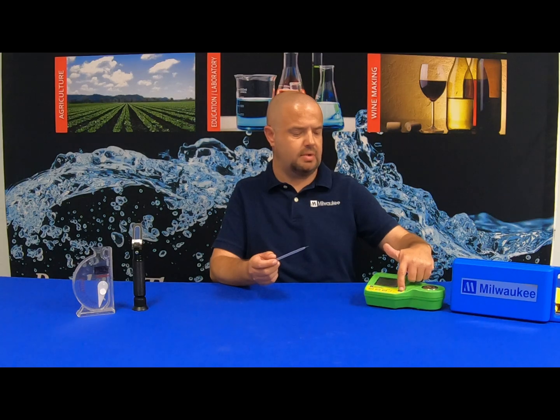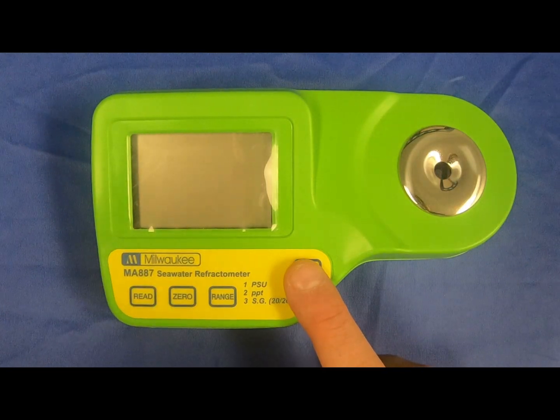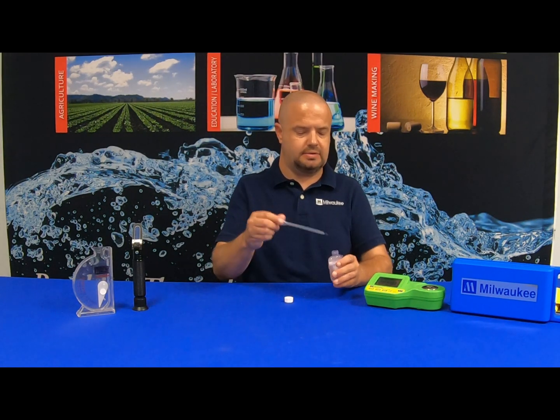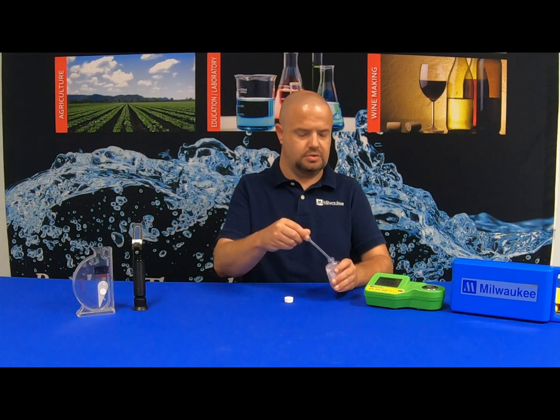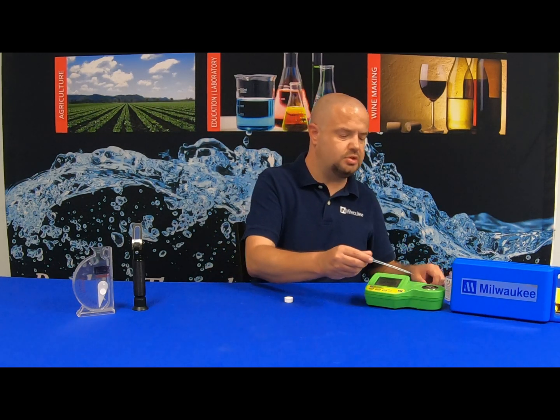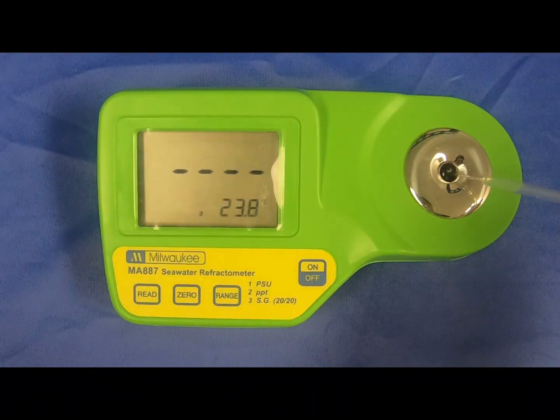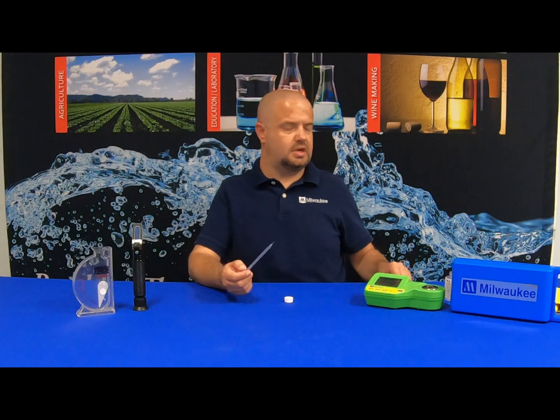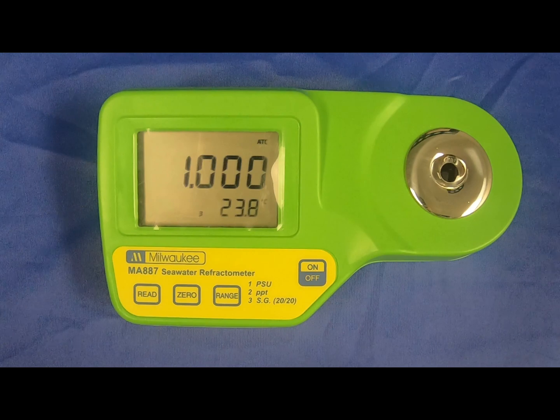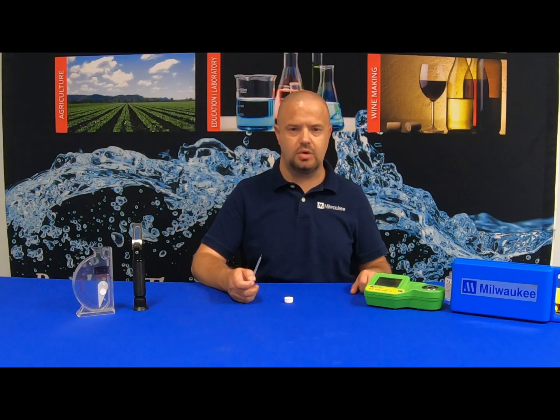We're going to start the calibration method by turning on the unit and taking our distilled water with one of the two pipettes. Draw a little sample out and be sure to cover the lens to get a good reading. Once you have your lens covered with the distilled water, simply hit the zero button. It registers 1.000 — your unit is now calibrated and ready to use.